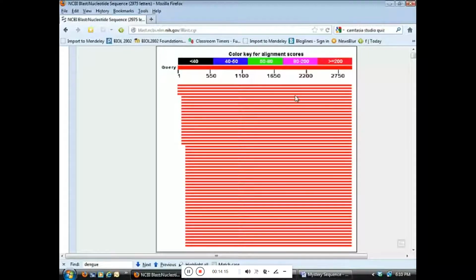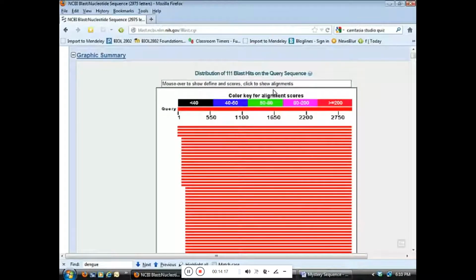Now I'll tell you, this time I chose HBB just because it happens to be a particularly small gene. It's rare in the sense that it fits on one page of paper. Normally genes would take up volumes in some cases. I also chose it because HBB is a very highly studied sequence, so that makes it a little easier and certainly gives us a lot more hits for this purpose.